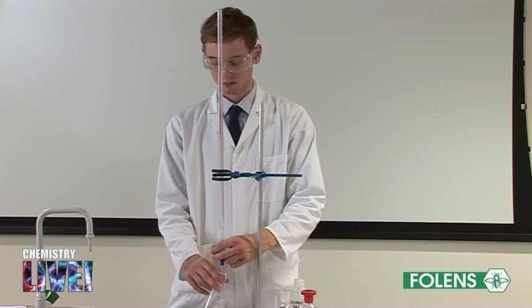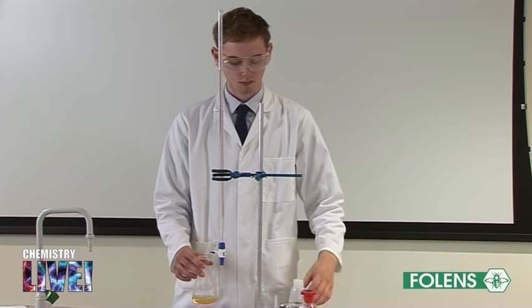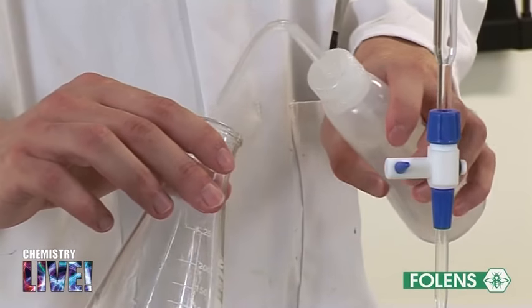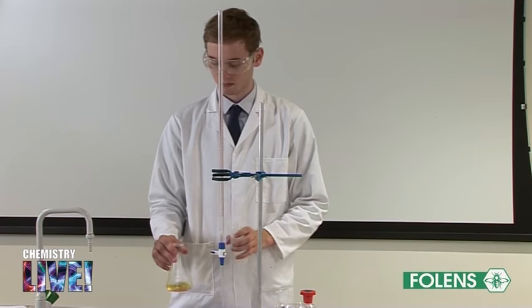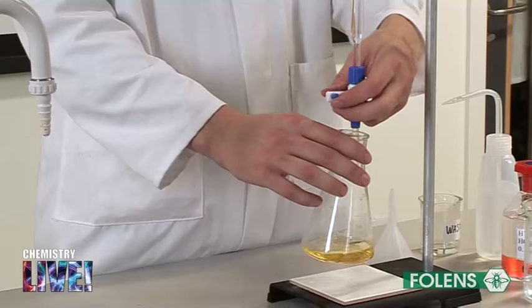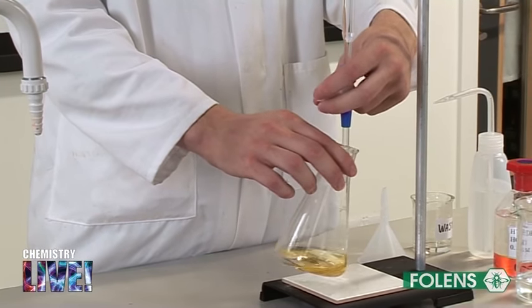Stop the titration from time to time and, using the wash bottle, wash down the sides of the conical flask. The reason for doing this is to ensure that no drops of acid are stuck to the side of the flask. It is important that all of the acid added from the burette reacts with the sodium carbonate.